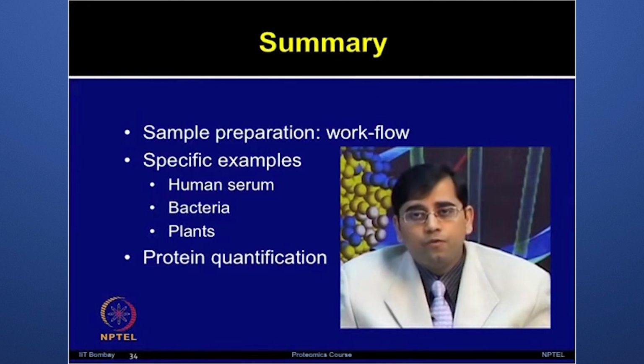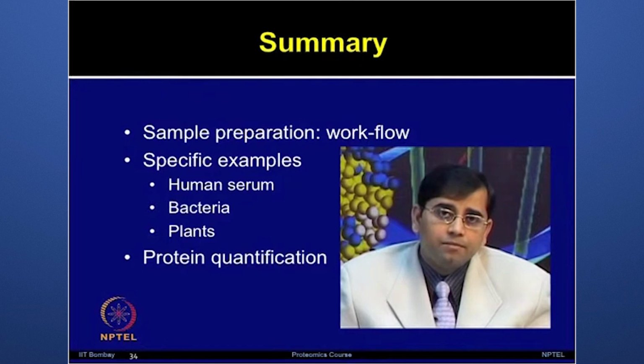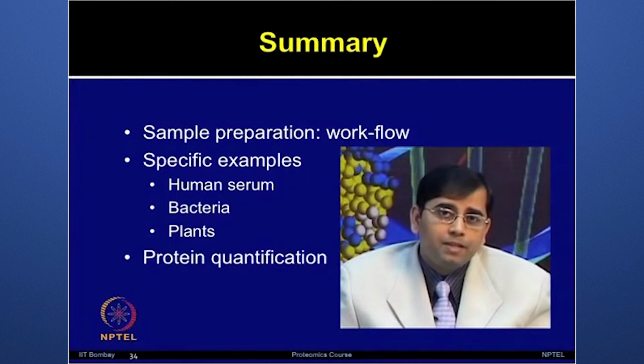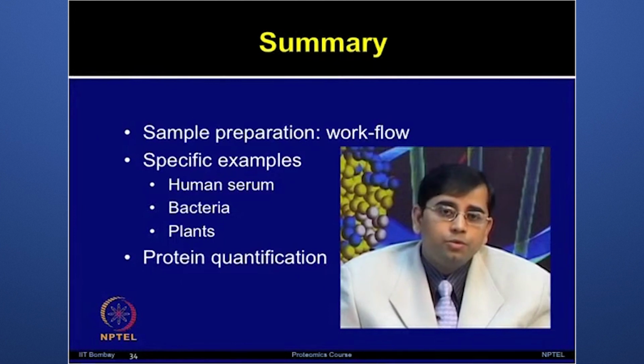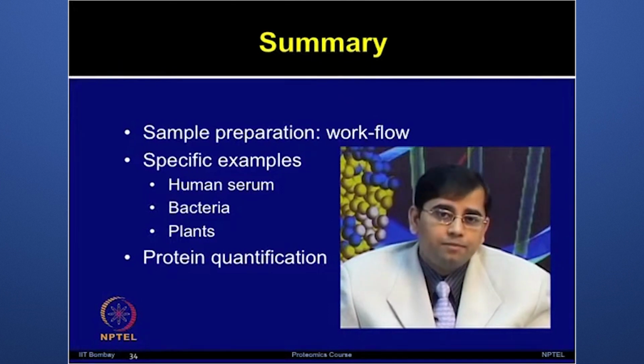I gave you a workflow where we talked about different types of lysis methods. We talked about how to pre-fractionate the samples, then how to precipitate the samples, how to remove the interfering substances, and then we moved on to the specific examples.